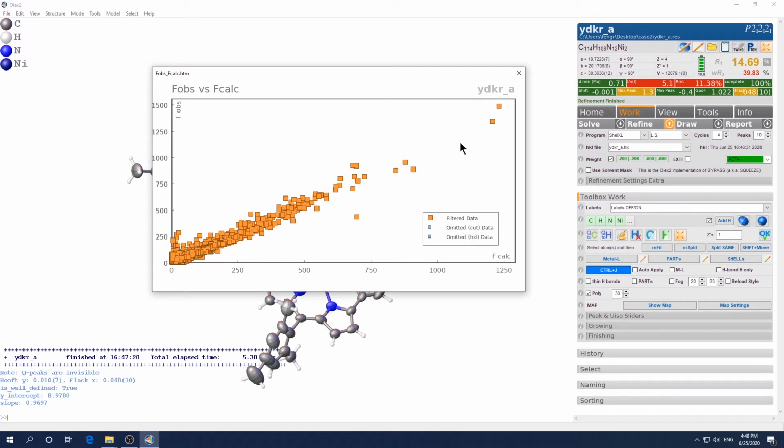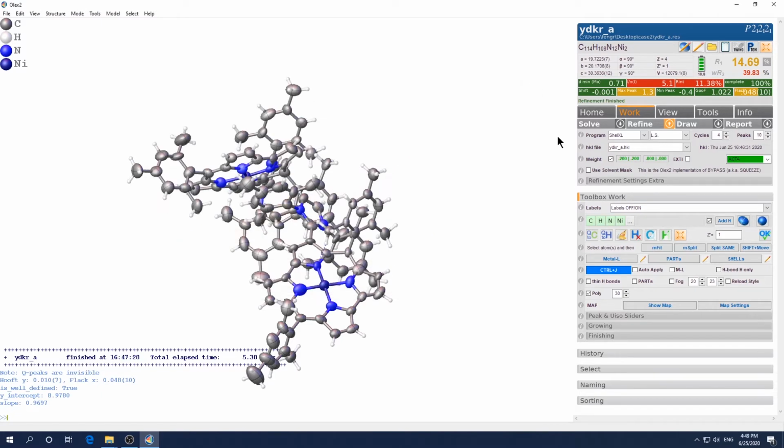I guess mainly because the raw data they collected from the instrument are very low quality. See, the intensity, I over sigma, is barely 5, and you want this to be the higher the better. With a modern instrument, it can easily get over like 50. So 5 is definitely too low. You probably want it to be at the minimum around 15 and above. So this alone indicates the data is so bad, and plus with R-int, something is definitely wrong with the raw data.